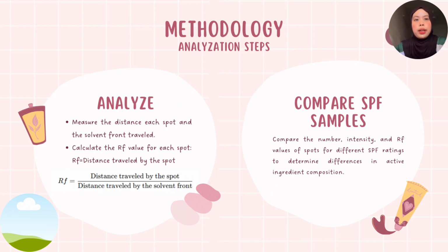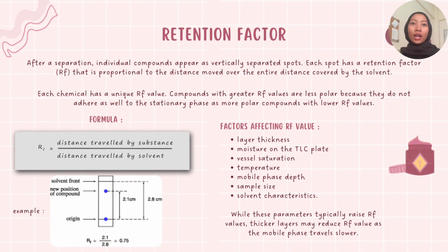Next is compare SPF samples. Compare the number, intensity, and RF value of the spots from different SPF ratings to determine differences in active ingredient composition. As for retention factor, after a separation, individual compounds appear as vertically separated spots.